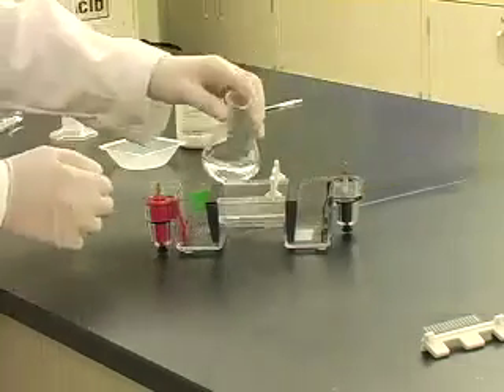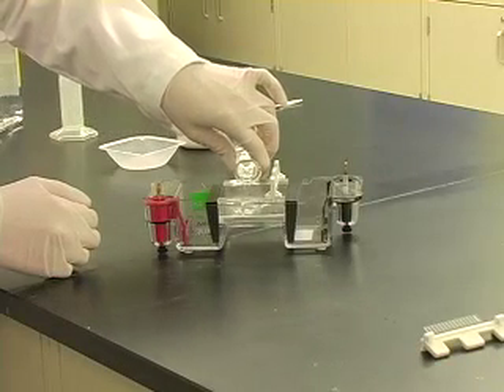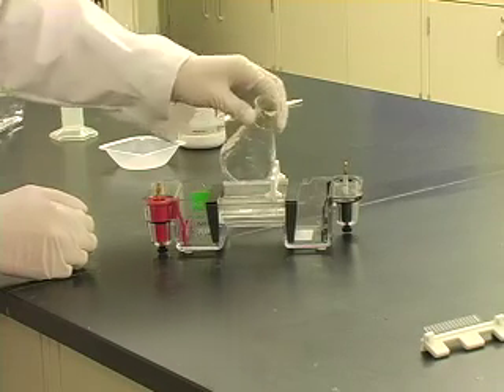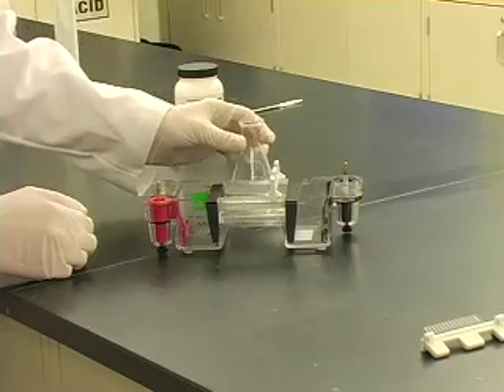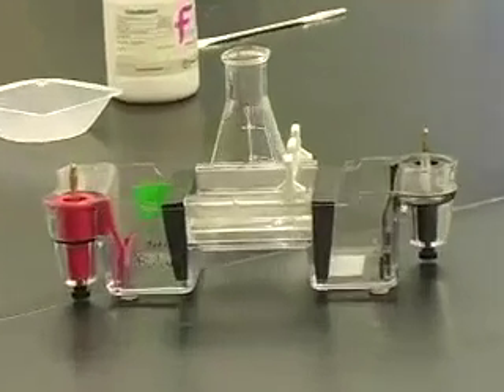When the flask is cool enough to touch, carefully pour the agarose into the mold until the mold is about half full, or according to instructor's directions. Make sure there are no bubbles in the agarose. Let the agarose harden in the mold — this will take about 15 minutes.